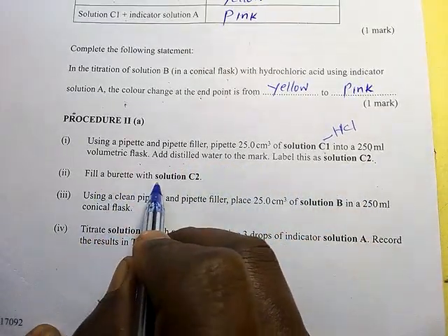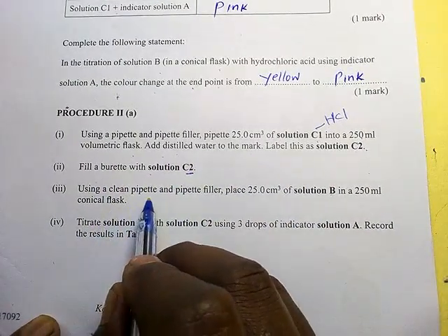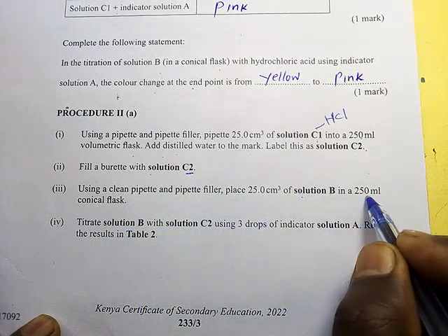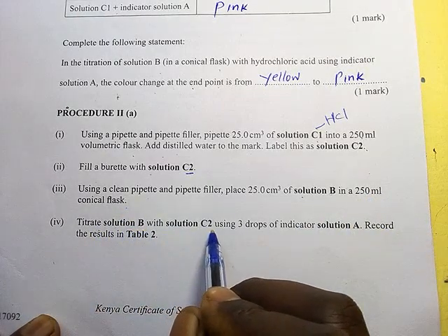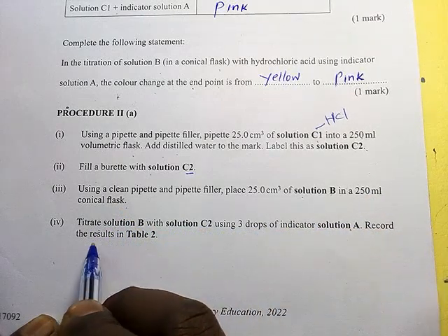Fill the burette. Now in the burette we have C2. Using a clean pipette filler, place 25 cm cube of solution B in a 250 ml conical flask. Titrate solution B with solution C2 using 3 drops of indicator solution A. Record the results in the table.